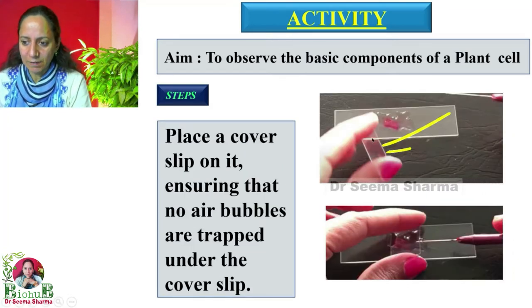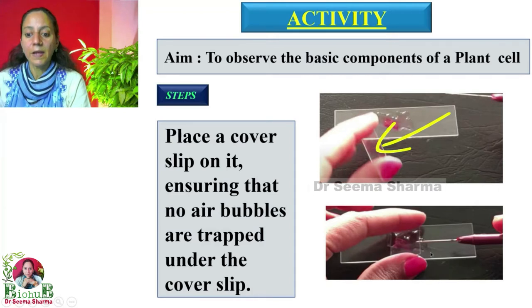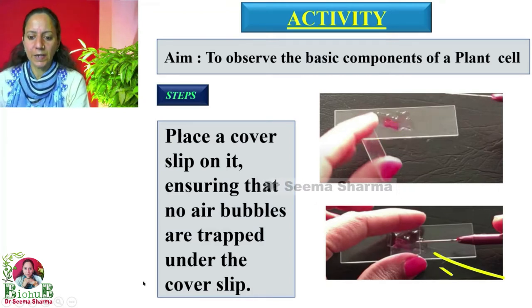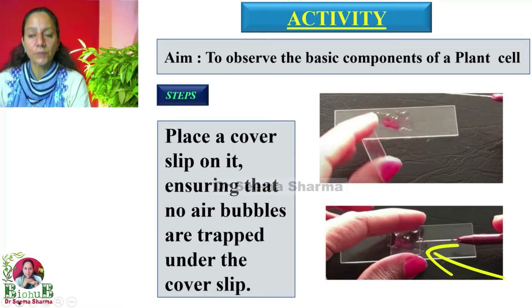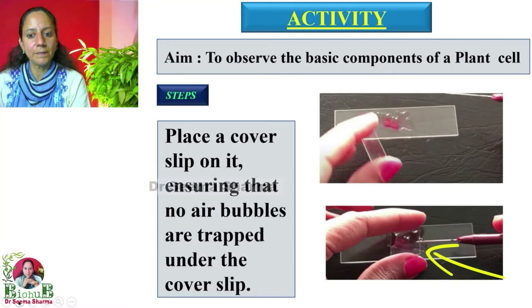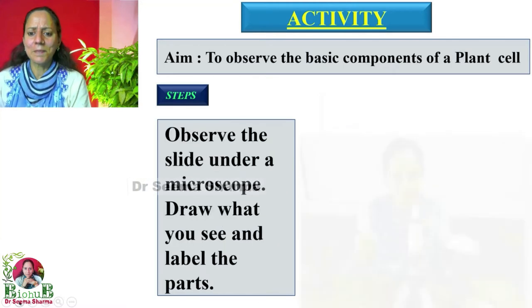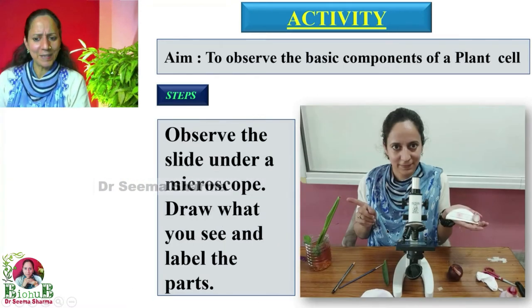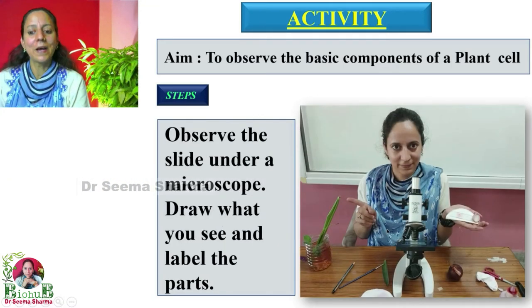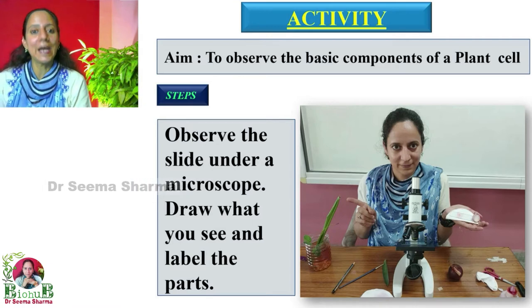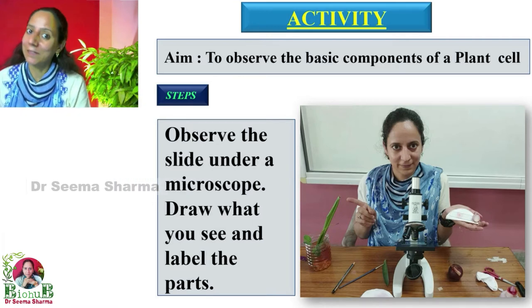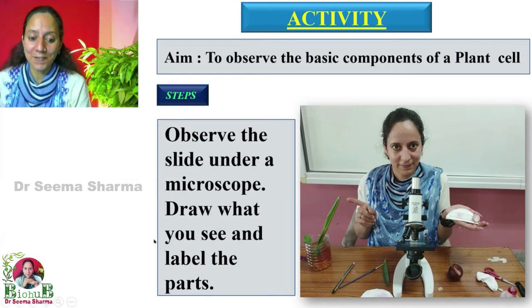This is the cover slip. We have to place it very gently with the help of forceps on the onion peel, so that no air bubble gets trapped under the cover slip. The next step is to observe the slide under the microscope, draw what you see, and label its parts.